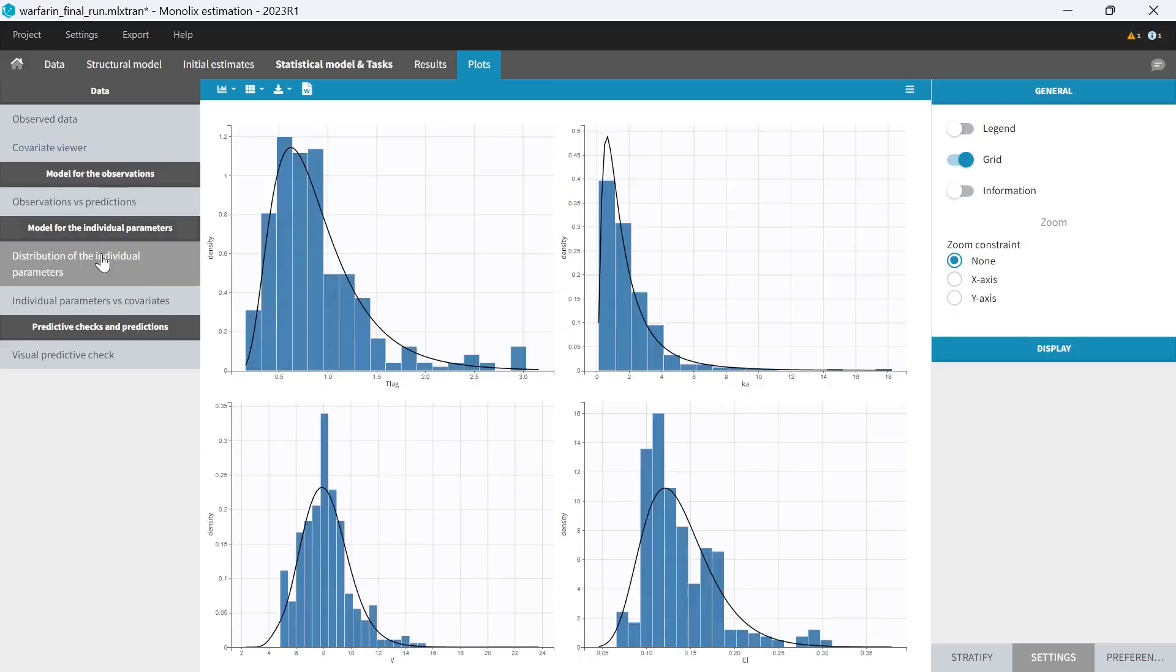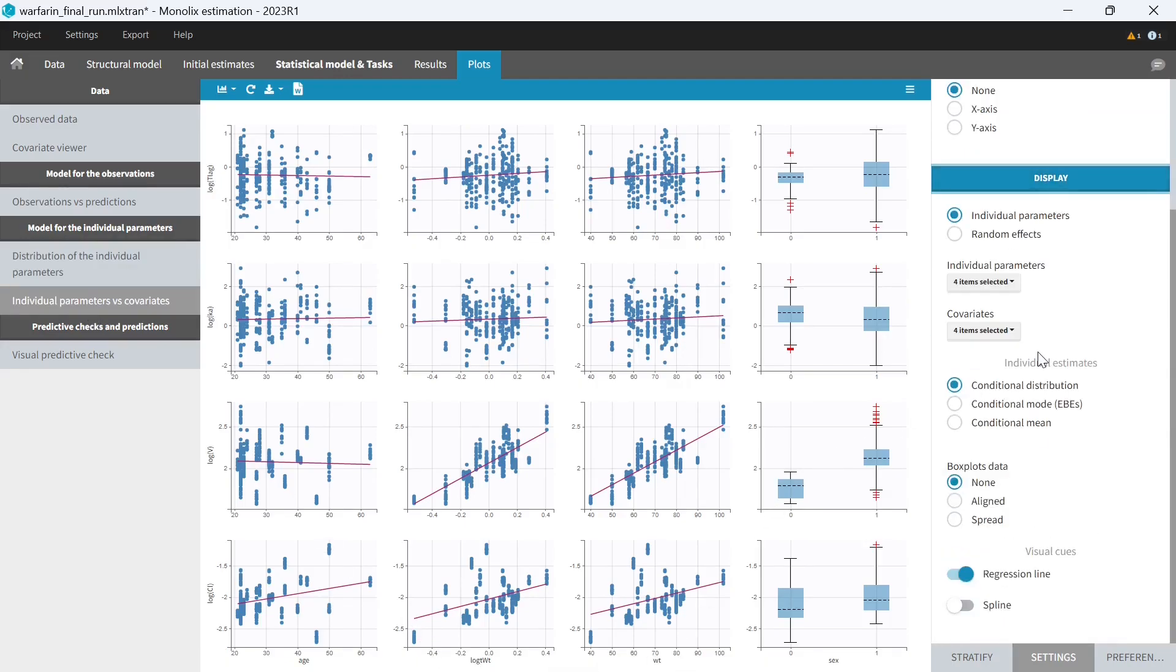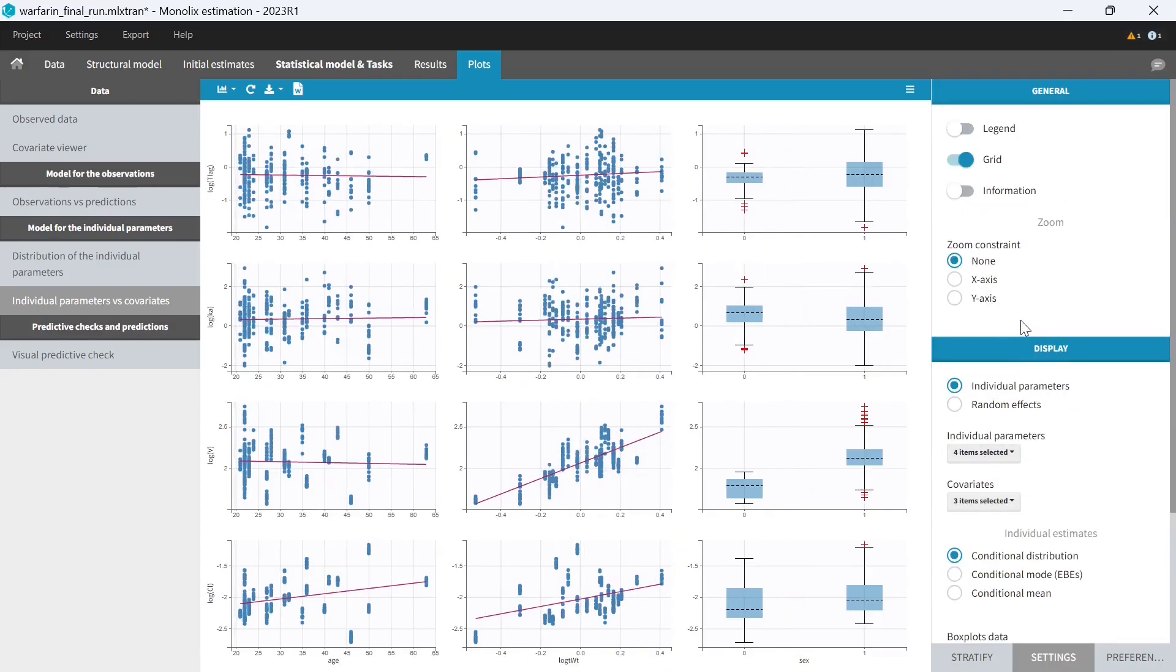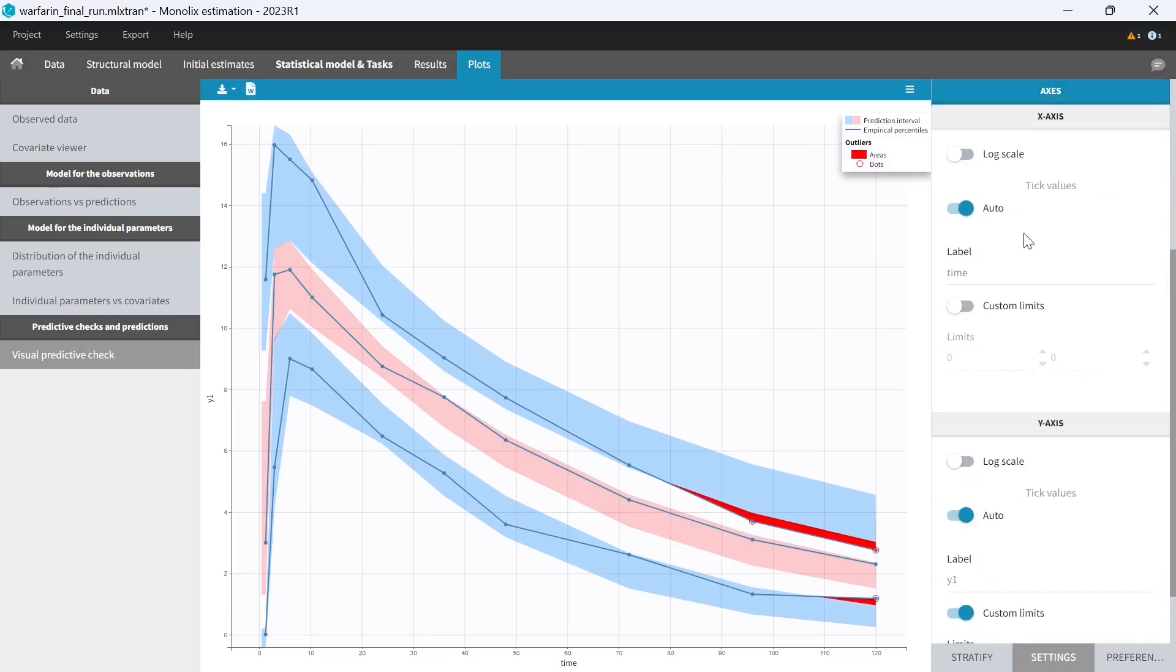On my distribution of individual parameters, I want to display the shrinkage. And for individual parameters versus covariates, I want to keep only the log transformed weight and not the weight. So I'm going to remove weight from the covariates in this plot. Finally, on the VPC, I want to display the legend and replace also the axis labels by the ones I used in the observed data plots.